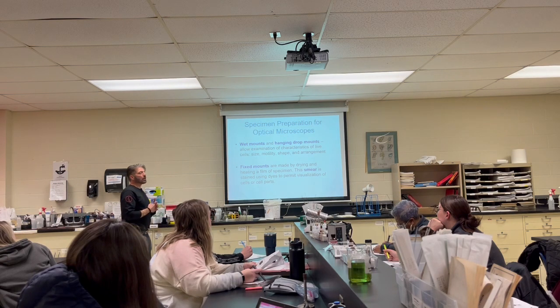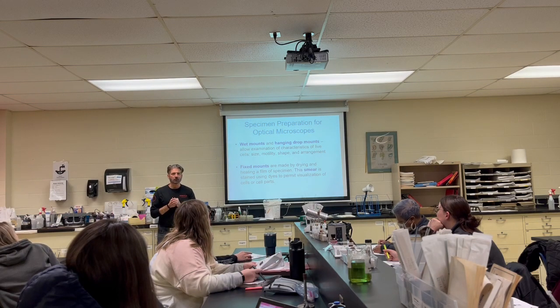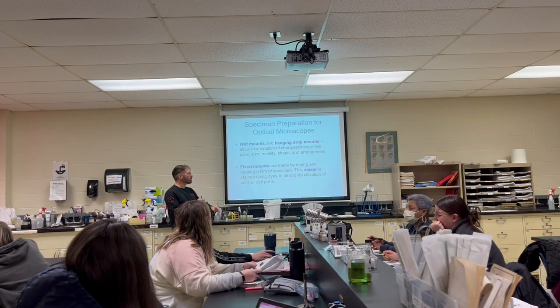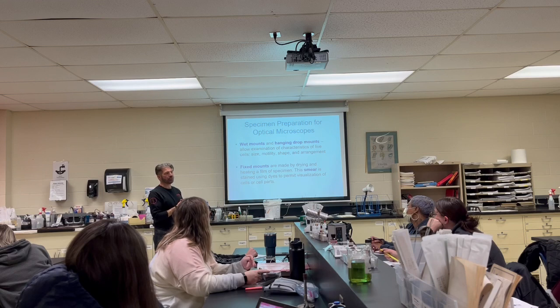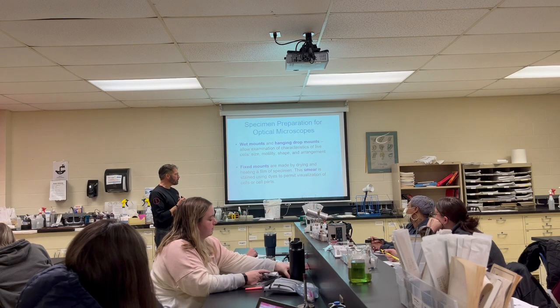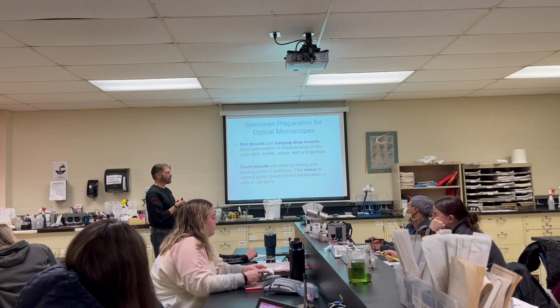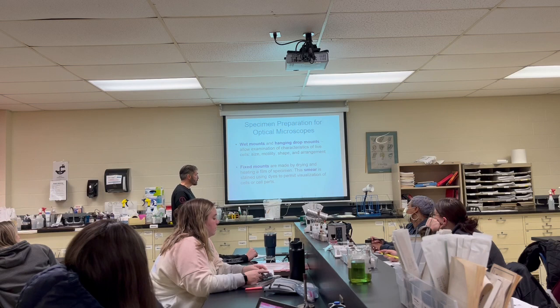We're going to be doing a lot of fixed mounts. Did everyone bring in a plate today? If you forgot, I'll give you another one. Did anyone have something not grow, or have nothing on there? It doesn't matter. We'll take whatever you brought in and put it on slides, heat fix it, stain it and take a look at it. Somebody had some mold under the plate, so it's going to be really large and filamentous, easy to see. If you have some bacteria, it can be a little harder to see. We'll do that quickly tonight if the weather holds up for us.